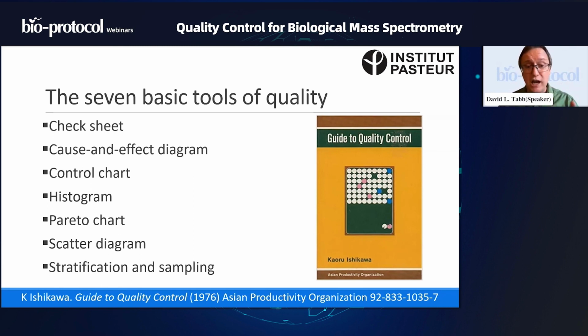Over time, a lot of the concepts from this book came to be called the 7 basic tools of quality. So I've given you the list of 7 here. Some of the later combinations of points into a basic tool are handled as separate issues, or were handled as one issue that later got separated into 2 basic tools. We'll try to just walk through this list.